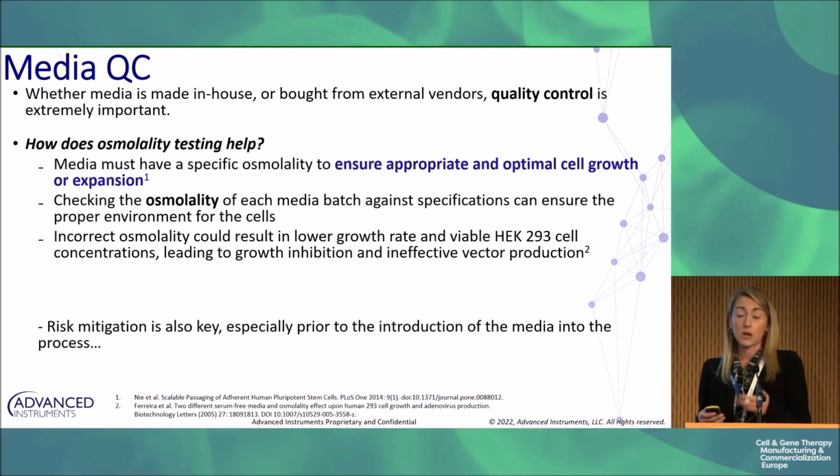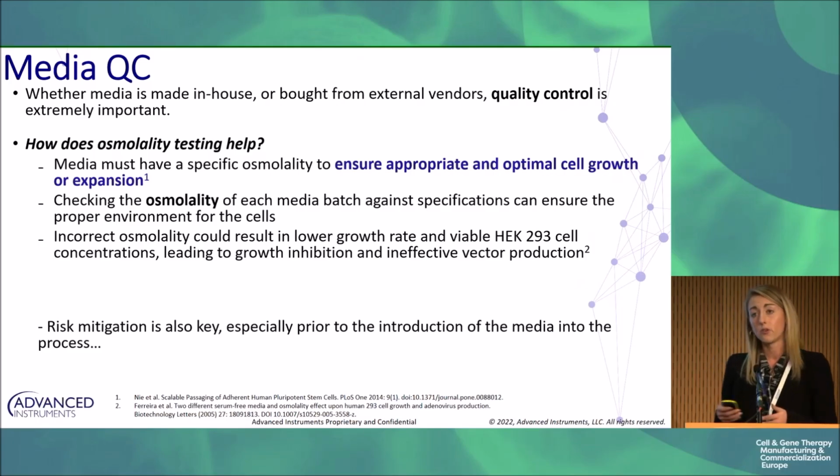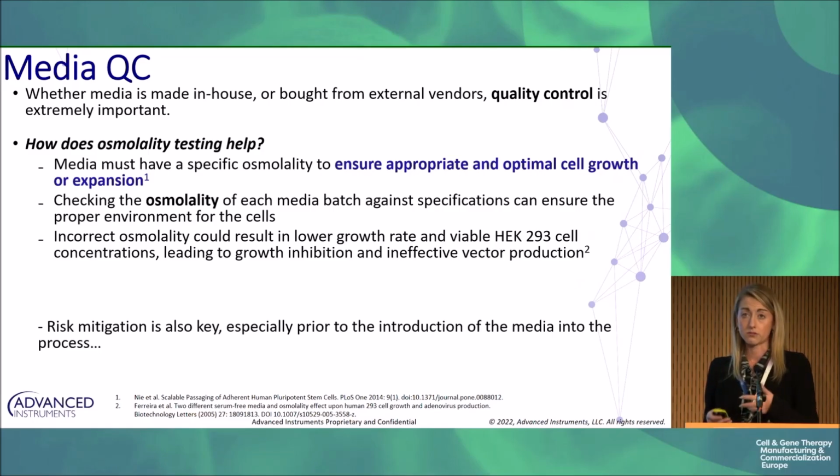They realized this by osmolality testing. Their osmolality was extremely high and therefore again detrimental to their cells. So without that process parameter, they would not have been able to resolve this issue.